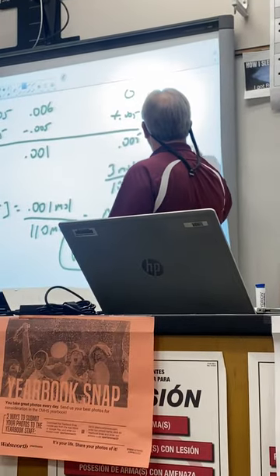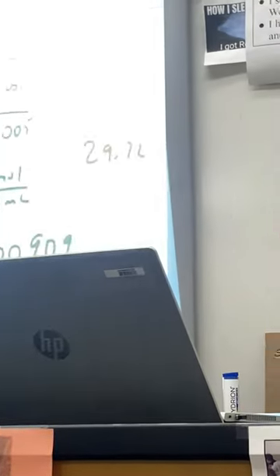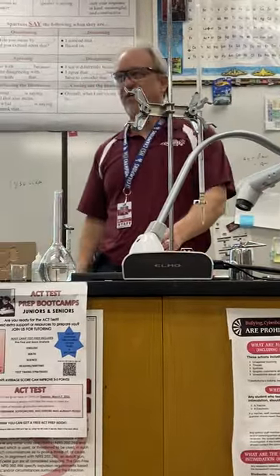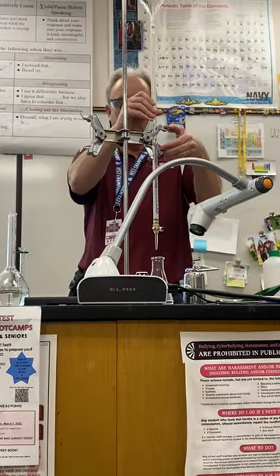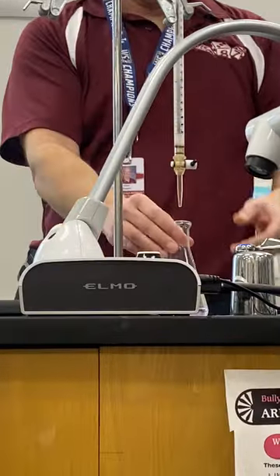So 29.72 is my starting amount. Now I'm gonna titrate. The first titration you could do pretty fast because you're gonna do 3 trials. So if you screw one up, that's okay. But I'll start out by trying to go just a little bit.